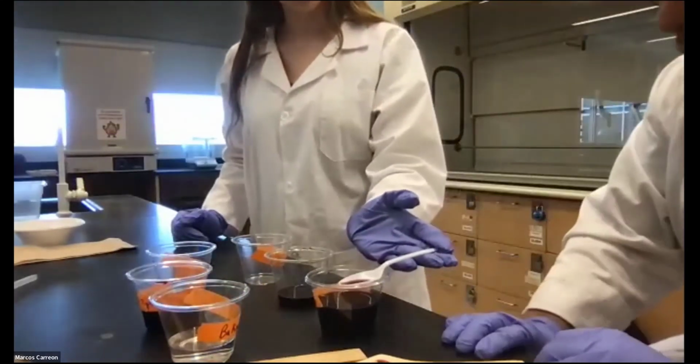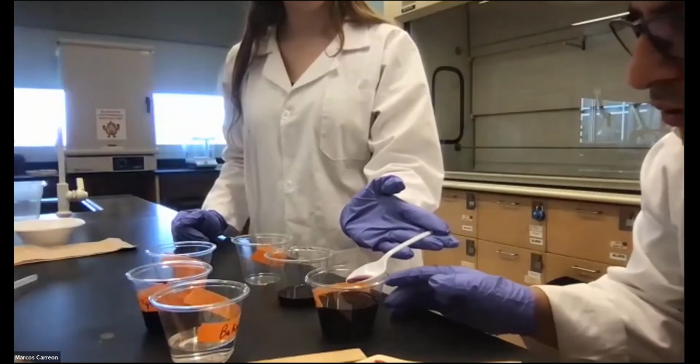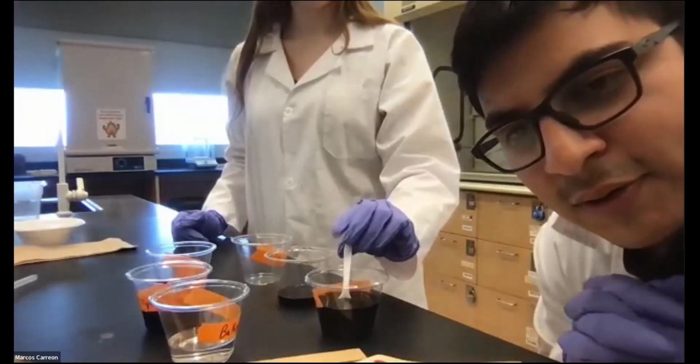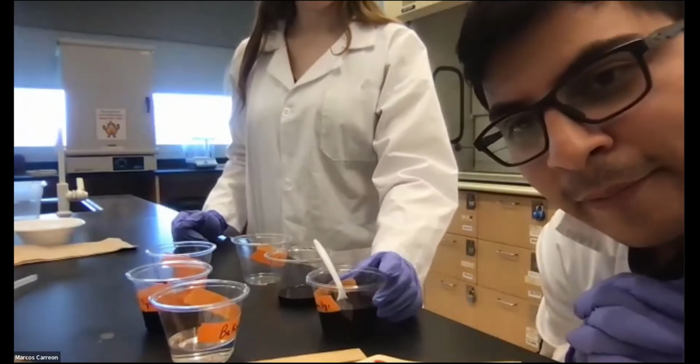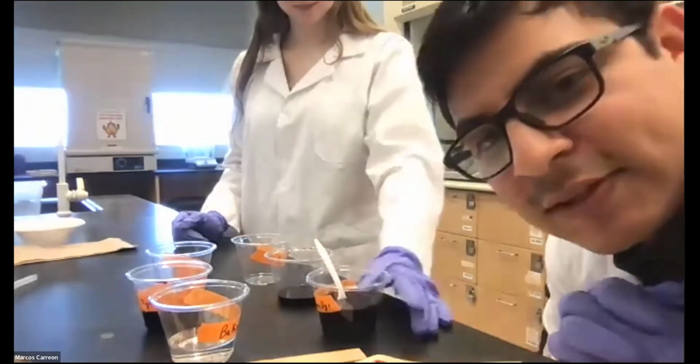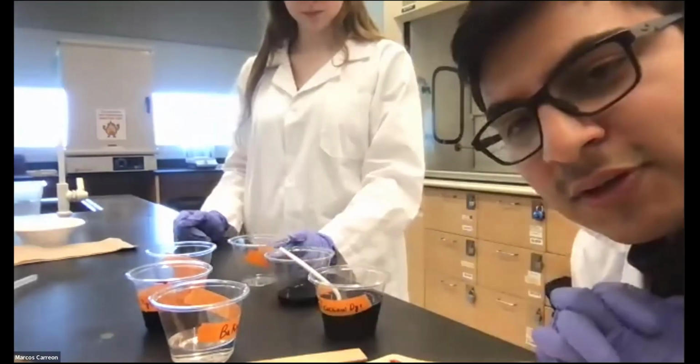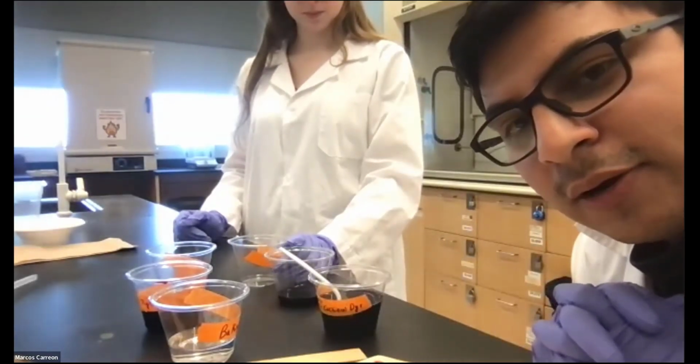So we're adding the basic solution to the indicator. So that's what's happening. That's why it's turning darker. So if it's darker, maybe what's going to happen when we add the acid, which our vinegar is, to the solution? Should it get darker or brighter?